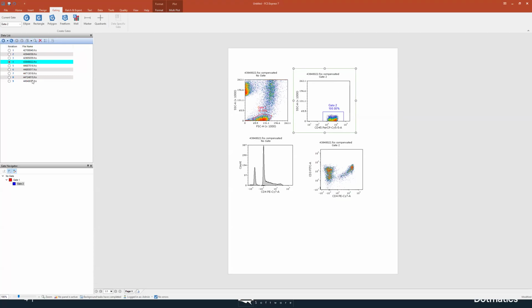You can see over here we've added radio buttons to the iterations. So you can click on the little buttons as well as the blue number to change things. This is because a lot of times people didn't realize that the easiest way to move from one iteration to the other is to click on these blue numbers. So we wanted to make it a little bit more intuitive by adding these radio buttons. So you think, oh yeah, I need to just click that button.